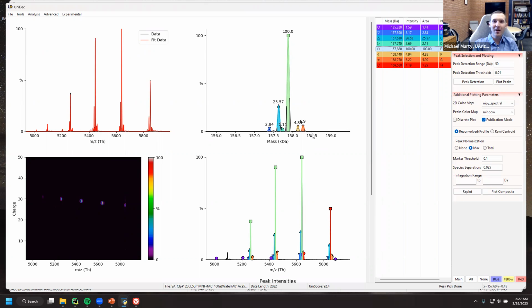I don't know, actually. At one point I tried to make it much more tolerant of sparse data, and so I think it should work, but I haven't extensively tested it. Especially if we would want to deconvolute full LC runs, right? I guess getting the less dense data might speed things up. Yeah, I think it would work. Yeah, it'd be fun to try.